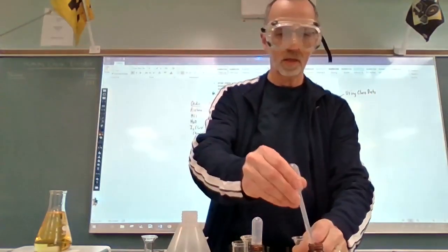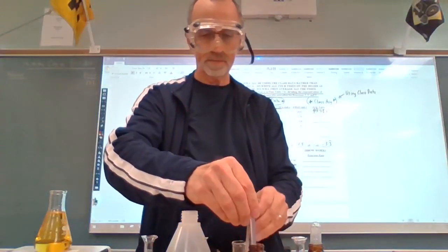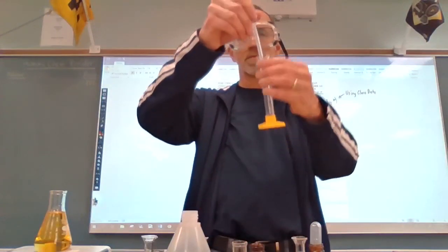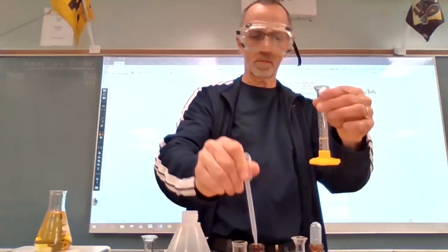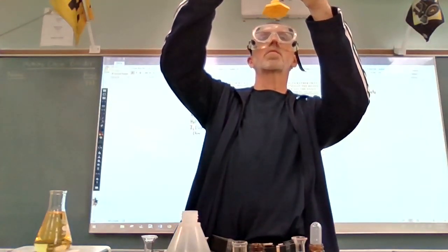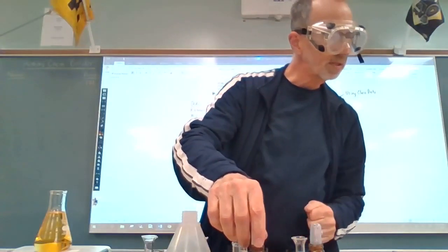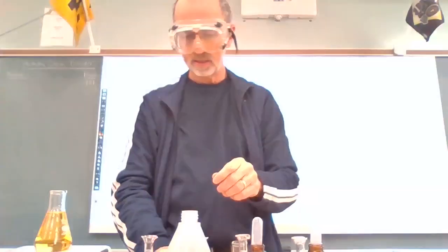Next, 5 mLs of HCl. Water, this time we just need 5 mLs.